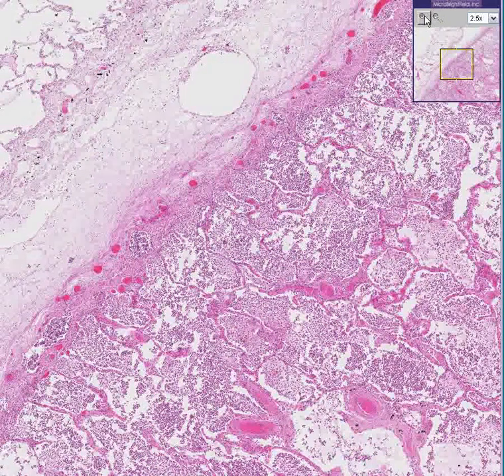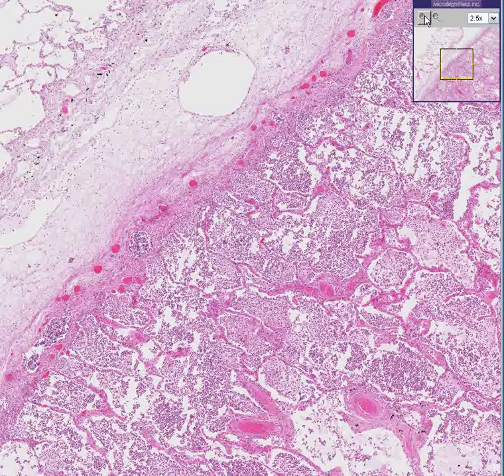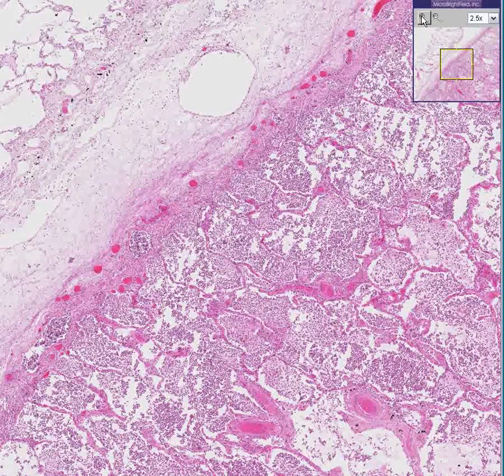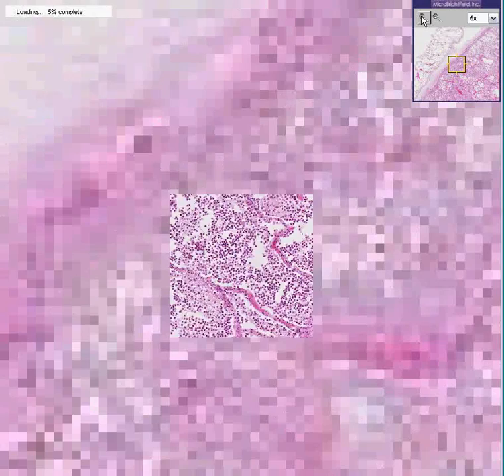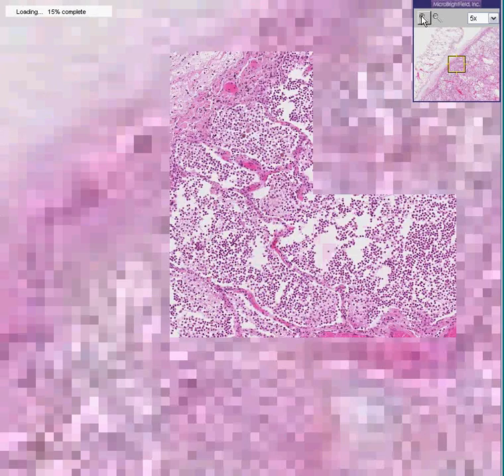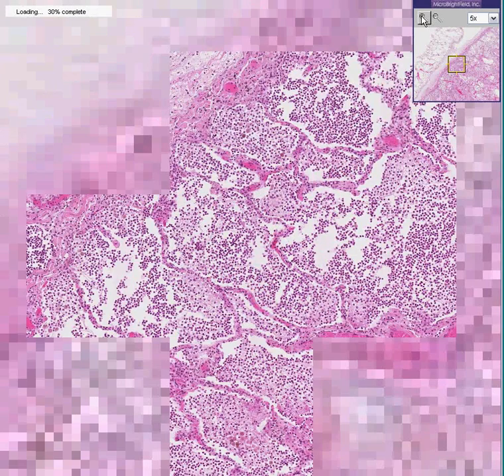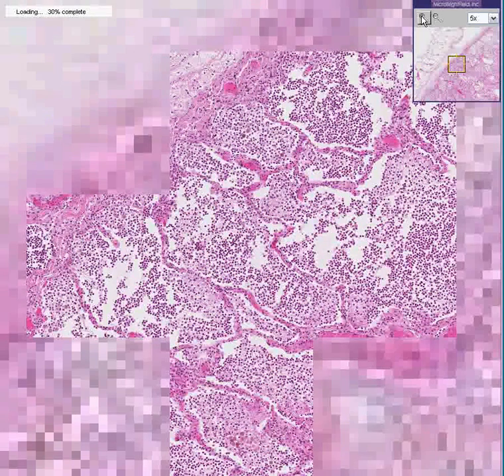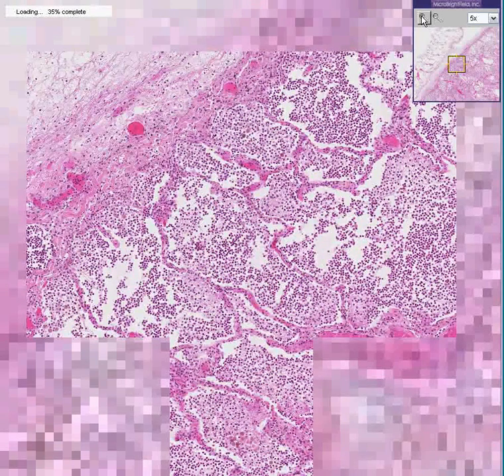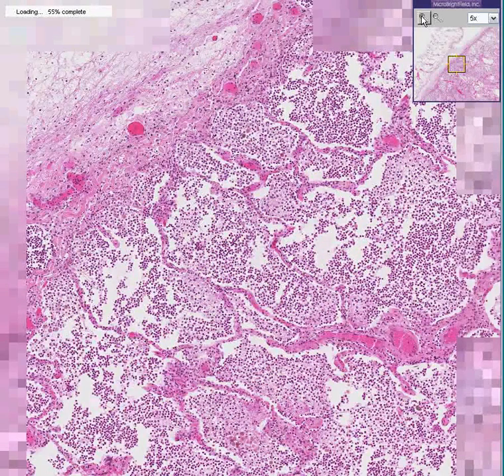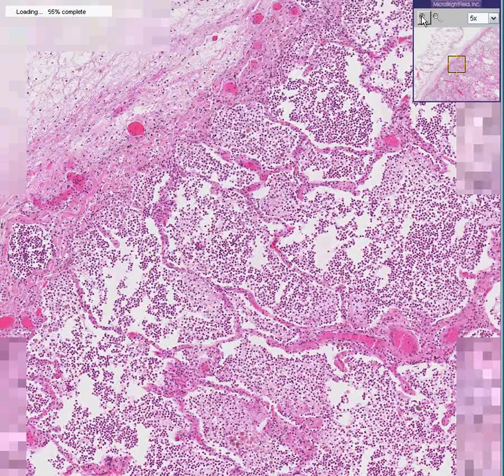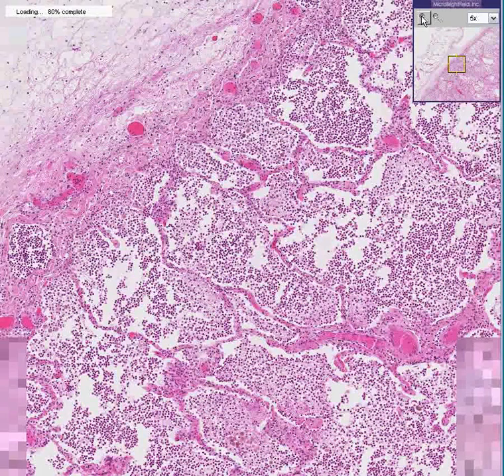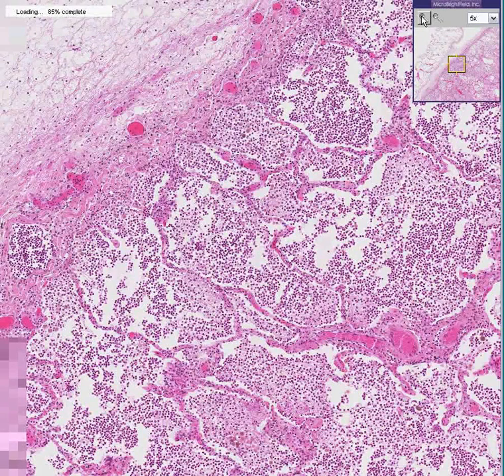We could culture this. We could maybe look at it more closely to see if we could find weird organisms. But this is the absolute classical picture of a lobar pneumonia.